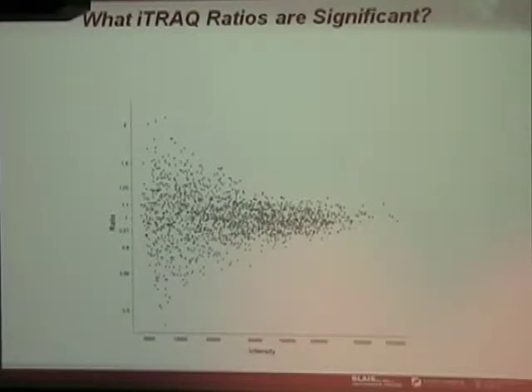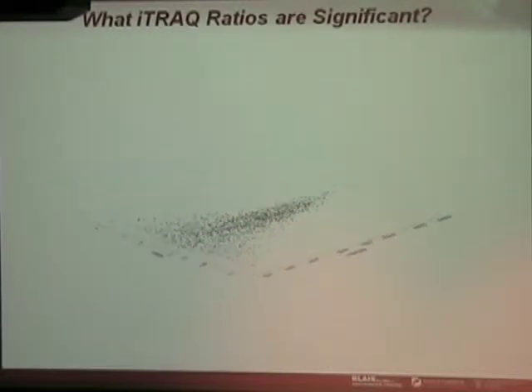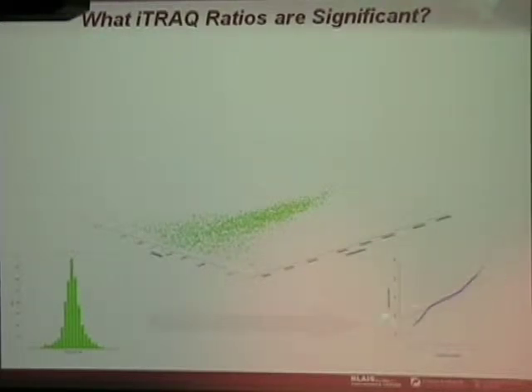The reason you want to do that is that if you put this on its side and look at the ratios and ignore intensity, they will be coming from a distribution that's over-dispersed. It's basically not normal. So on a QQ plot with a normal distribution, the tails are heavy, and that's because some of these are very low in their variance and some are high, and they're just different distributions.